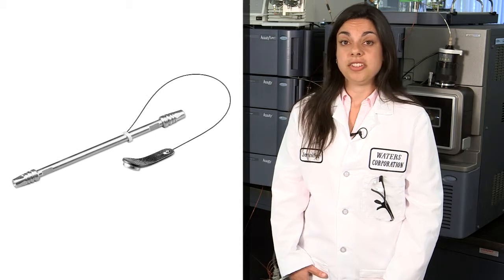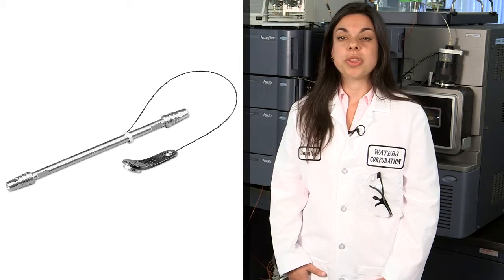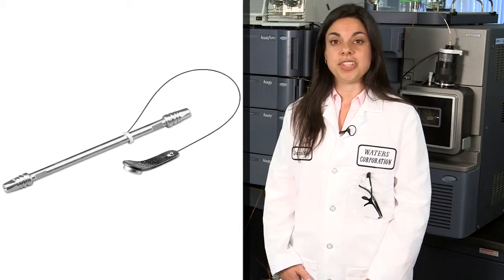For UPLC, we ran a reverse phase separation using an ACQUITY UPLC BEH C18 column. We used water and acetonitrile modified with ammonium hydroxide as the mobile phase. Then, we took the same sample and injected it onto the UPC² system using a UPC² BEH column and a gradient made up of carbon dioxide and methanol with ammonium hydroxide as the additive to the methanol. Let's look at the data.